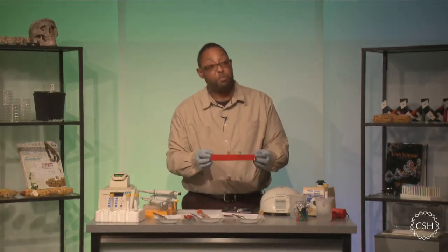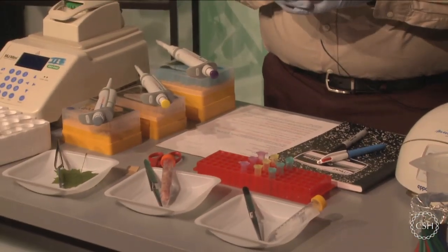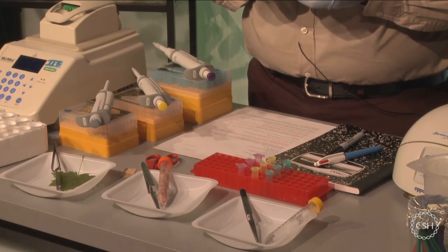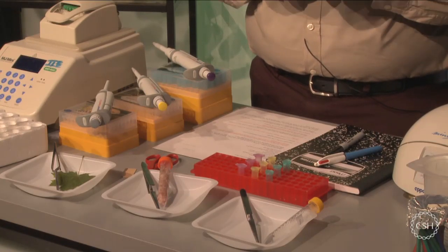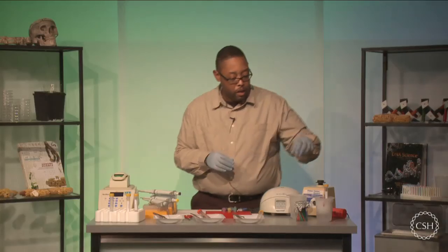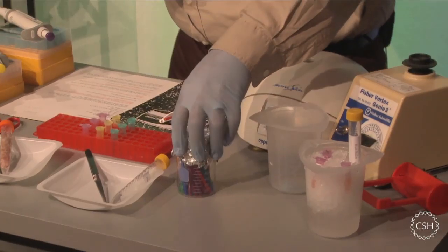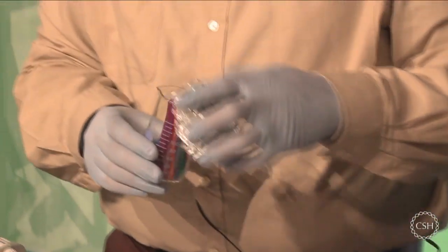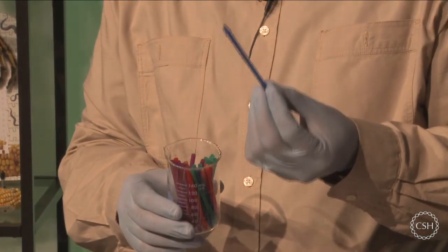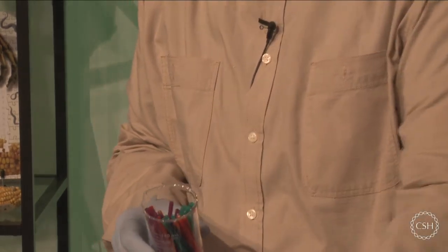We should have a rack with some test tubes available to us. I recommend having at least 3 test tubes, but 2 will suffice. The idea is that we're going to go through a series of steps where we're extracting physical DNA, and we're going to want to make sure we're collecting and discarding any material that's not necessary. We are also going to need a beaker of crushed ice, which you saw me put the wash buffer into. That's to make sure we keep things cold. But we also are going to need some autoclaved pestles. Okay? So you're going to want to make sure you have clean pestles to work with for each experiment. Okay? So I'm just going to put these out because I'm going to need them.